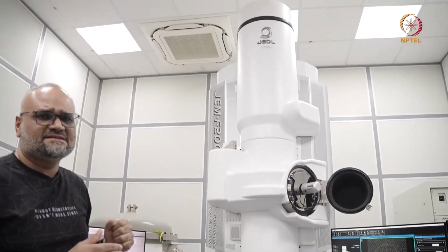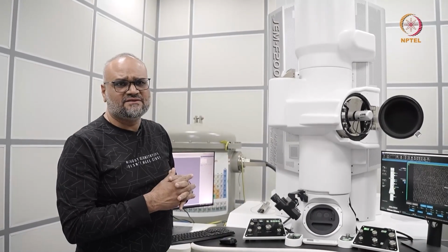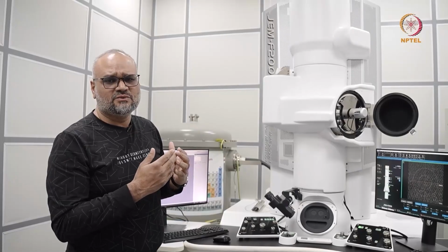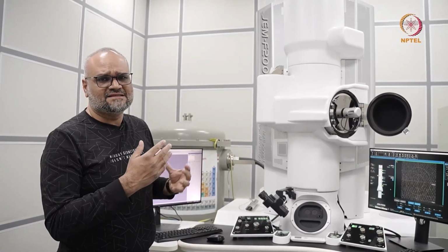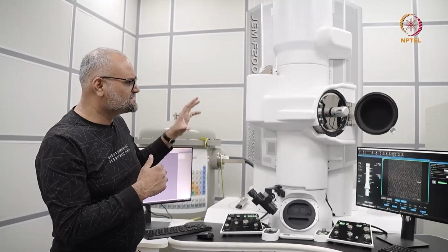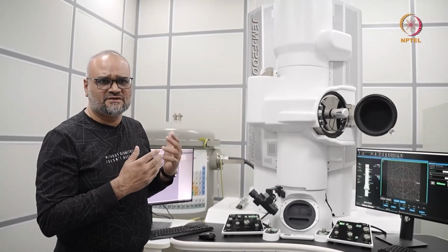So the idea is, in a cold field emission microscope, which is extremely sensitive to ultra-high vacuum, to have more stable emission, you would want to maintain as good vacuum for as long as possible. And this is achieved with a combination of several sputter ion pumps as well. So in this system, you have 3 of them. And the operation sequence is also similar to the other microscope that I told you.